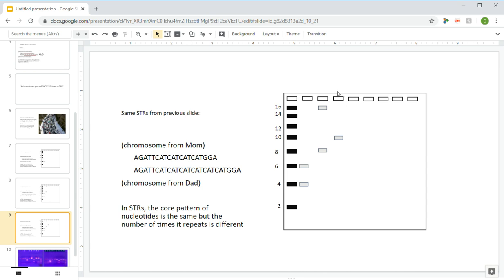Okay, so we've added our third sample here. It runs through the gel. So you can see this person only has, in their whole lane, from top to bottom, only one band in the entire lane. And since that band matches up with 10, that means this person, again, is homozygous. So instead of being like big A or little a, this person's genotype would be 10, 10.